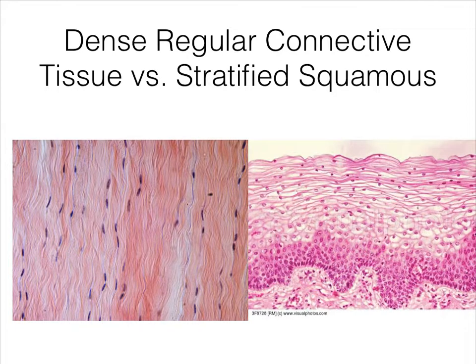squamous epithelial tissue as an epithelial tissue will almost always face a lumen or open area on one side. Secondly, stratified squamous epithelium is usually going to be seen in the context of skin or some sort of lining of your mouth or something like that. So it will be associated in a context, which is layers of squamous cells on top of some basal cells, and then on top of dense irregular connective tissue, dermis underneath. So you can sort of recognize it from the context.